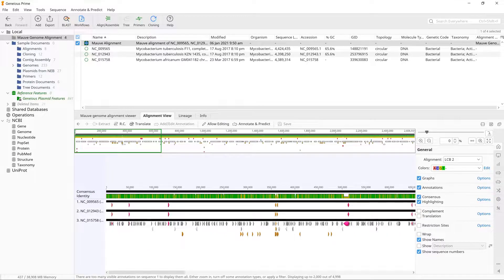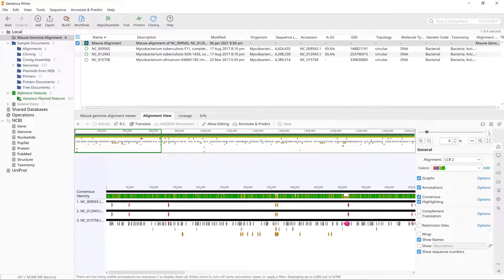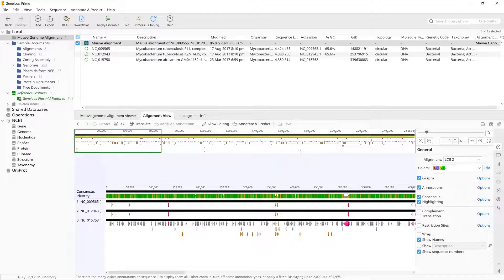Check the arrow directions on the source annotations in this view, and you will see that NC_012943 is in the opposite orientation to the other two sequences in the alignment.